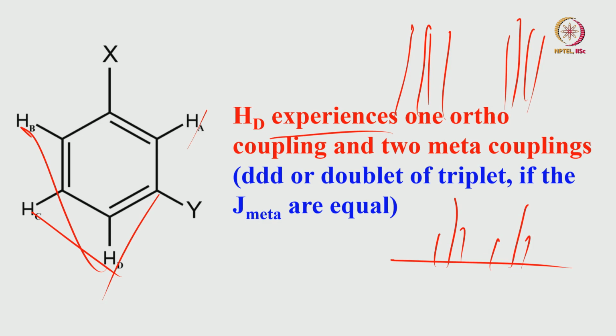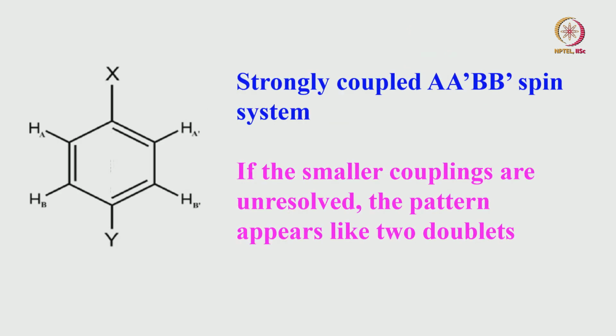So this is the idea, I just wanted to tell you, if you have a phenyl group present in your molecule, how you go ahead and analyze this thing. So we will go to the example of an asymmetrically para disubstituted benzene group. Remember this para disubstitution, in principle at a low frequency spectrometer, is going to be a strongly coupled spin system.